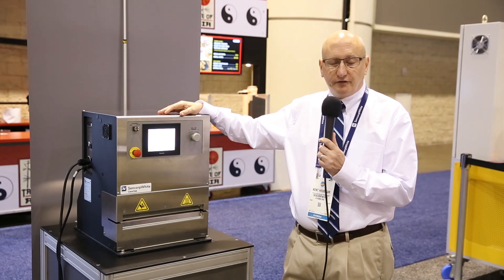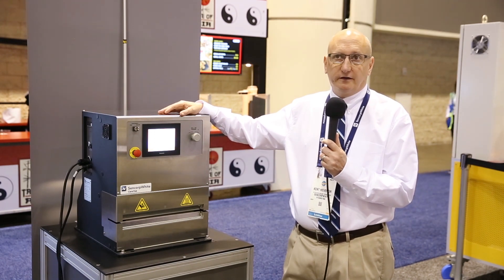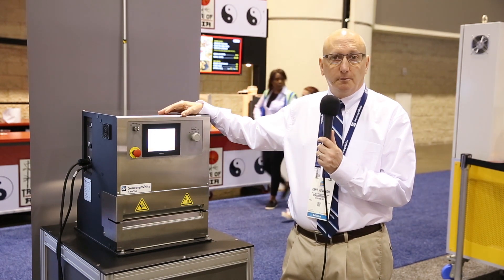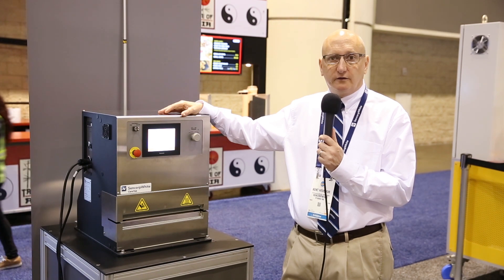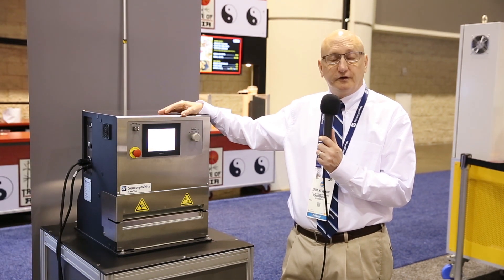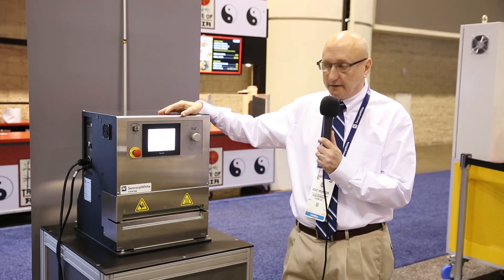Sencorp laboratory heat sealers have been the industry standard since back in the 1960s. Some of the original MILSPEC standards were written around the Sencorp laboratory heat sealers when the company first introduced those back in the early 1960s.